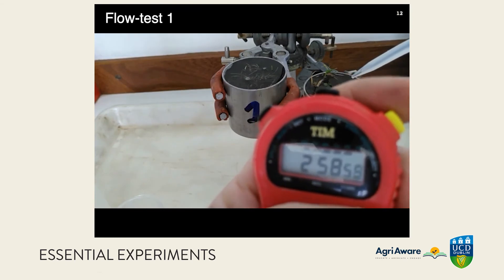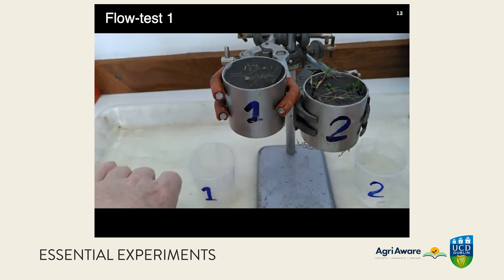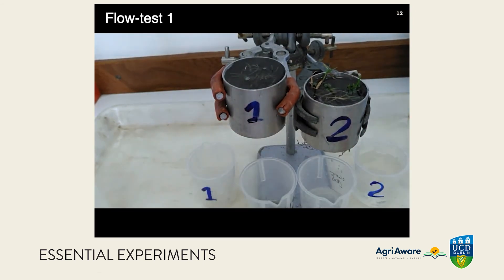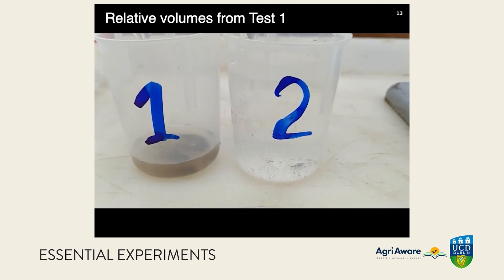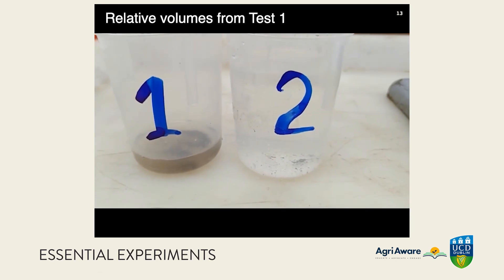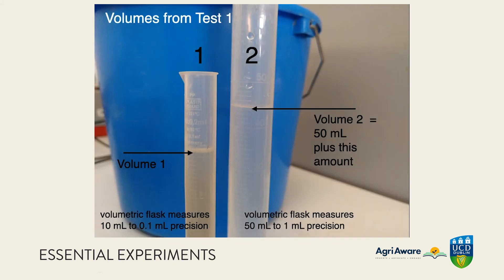At the end of three minutes we stop the timer, and we need a couple of seconds to switch the beakers around, which cancels out the error introduced at the beginning. We can see, very roughly speaking, the difference in volume from the two soil samples — very much more water coming out of sample two. The volume from sample one is close to the 10 ml mark, while sample two has given a full 50 ml plus additional volume.